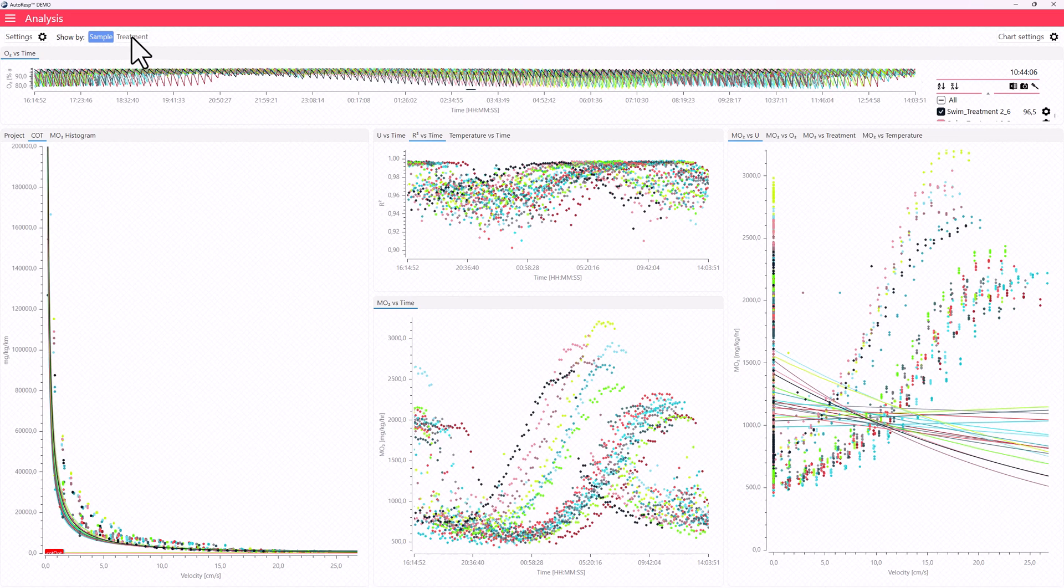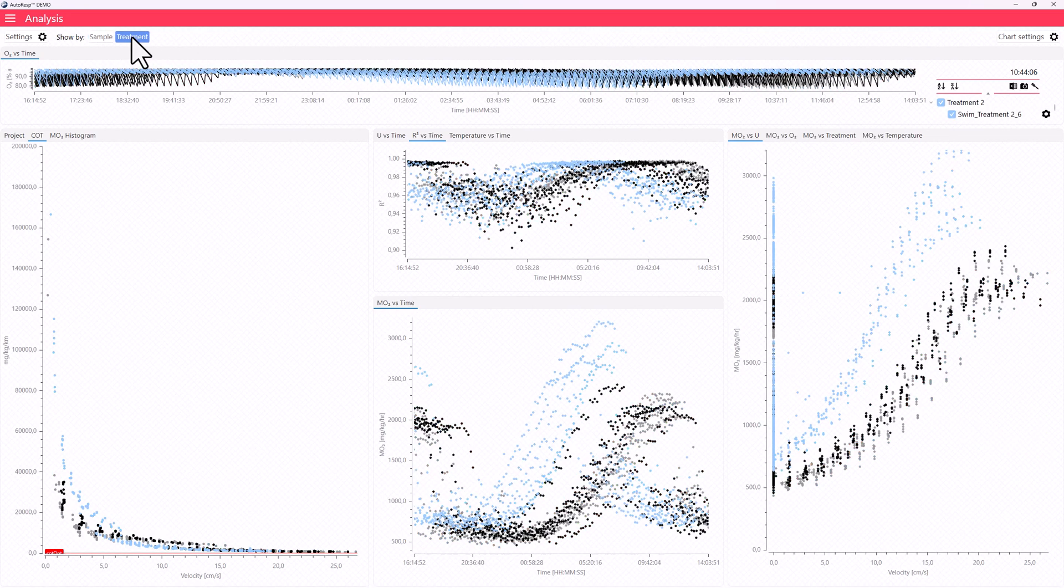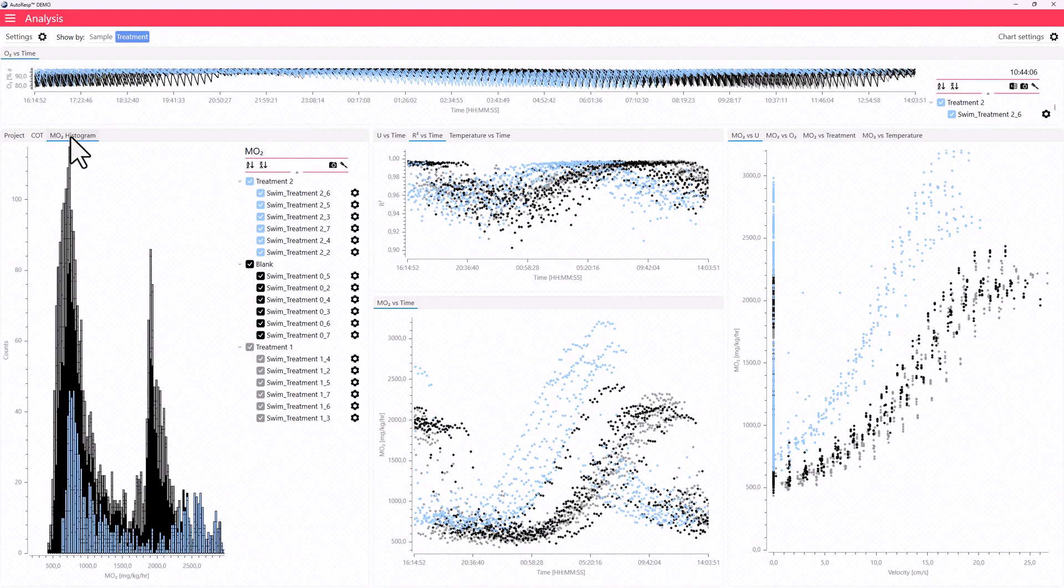And with a single click, you can now compare data between treatments, groups, or species.